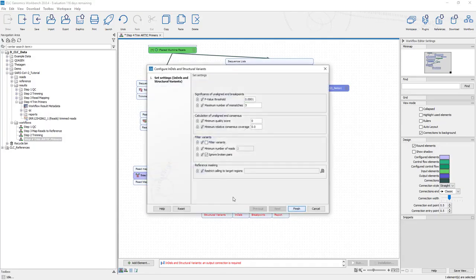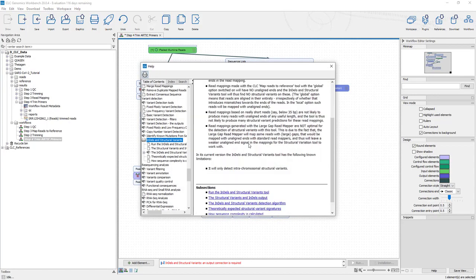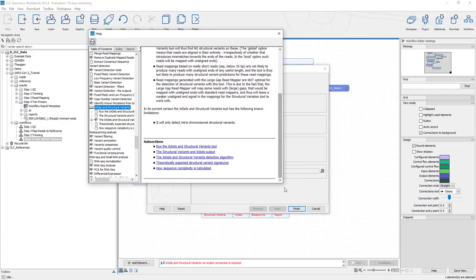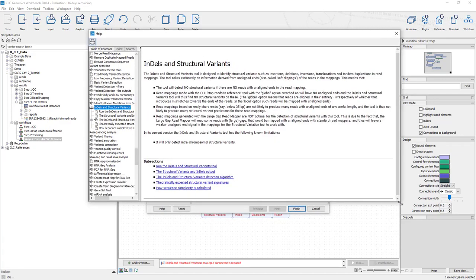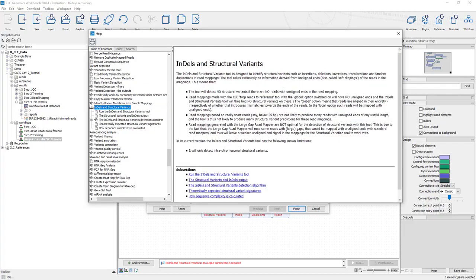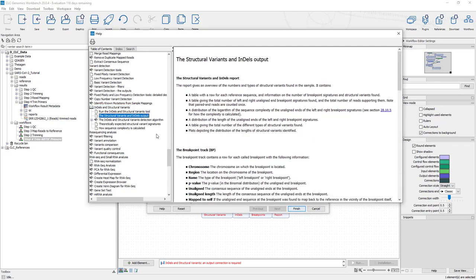And then there's multiple outputs that you can get from this also. So I might have closed that help a little prematurely. Let's open this up a little bit wider so we can see, and move over to what our outputs are going to be.